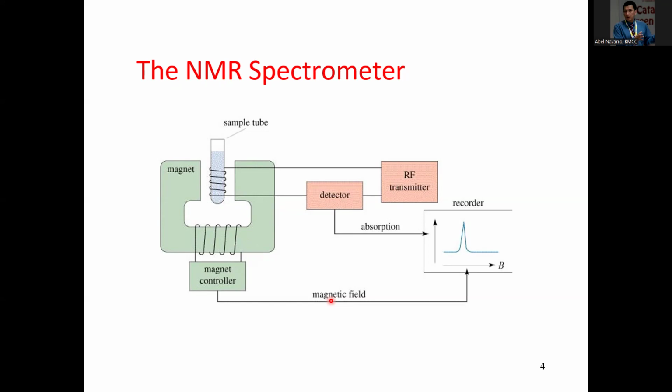The magnets I have seen can even go to a second floor. The one that we have in the lab is maybe 3 or 4 feet tall, very small, maybe 1 meter high, about up to your waist. That's the height of the instrument, and that's a 60 megahertz NMR.